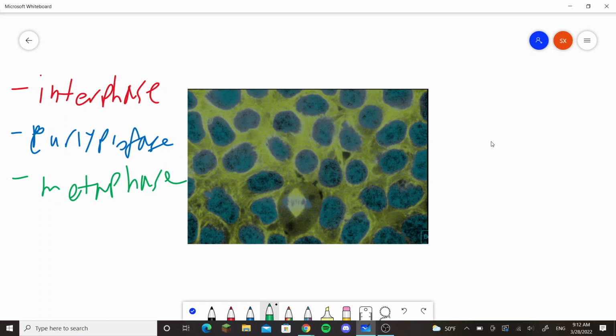All right, so I'm assuming you've paused the video, so here are the answers. For interphase, what are we looking for? We're looking for relatively intact cells where it's still chromatin, right? And these are still relatively intact. Honestly, we can circle these, and we're going to be counting these up later. So it's very important that you keep track of these. Really, these are all the intact ones.